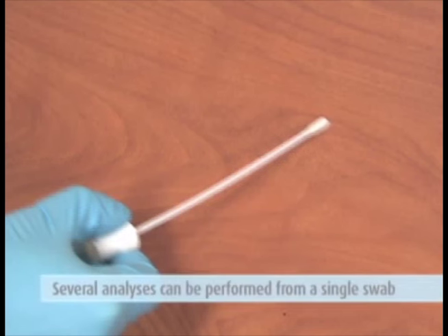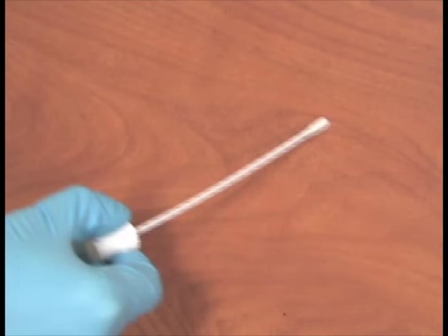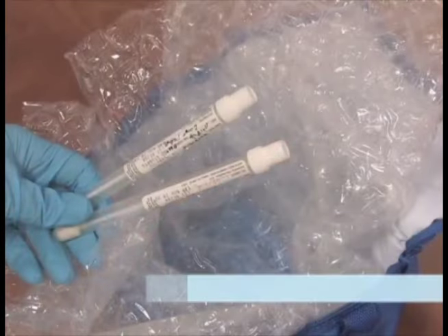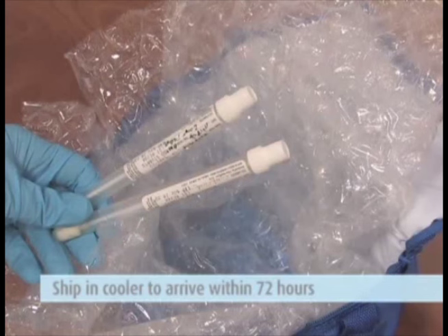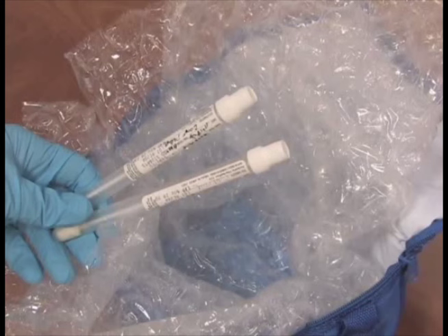Because several analyses can be performed from a single swab, there is no need to take multiple samples from the same area. Swabs should be shipped in a cooler to arrive at the laboratory within 72 hours of collection to maintain sample integrity.